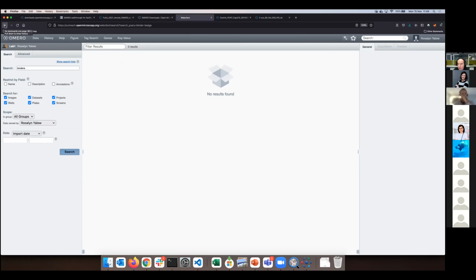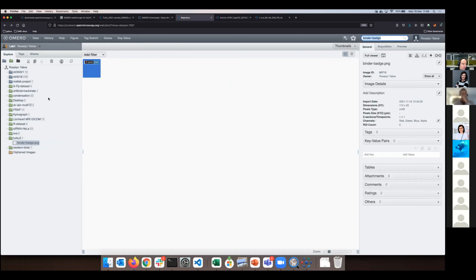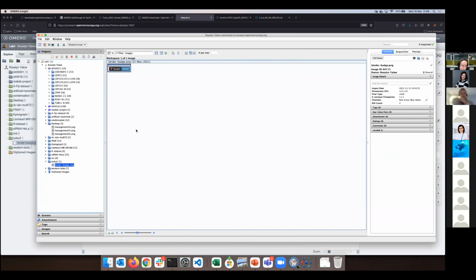Okay, so yeah, thank you for going through with that. The other way to find out, and this is a really absolutely sure way, and it's really fast. You can see that the images have IDs.